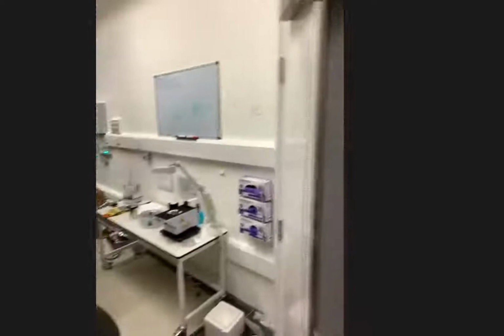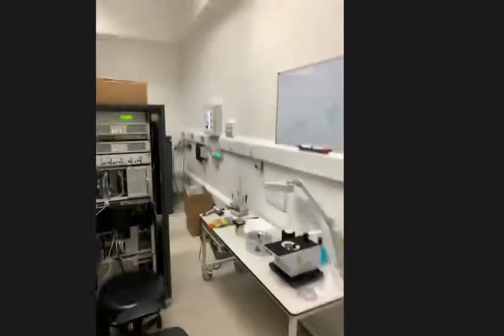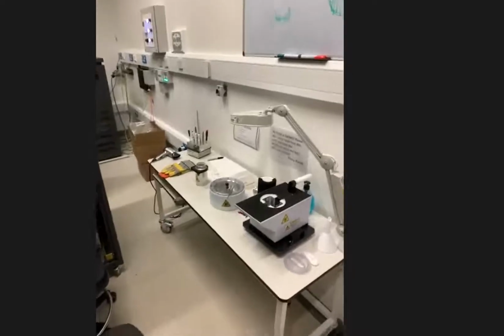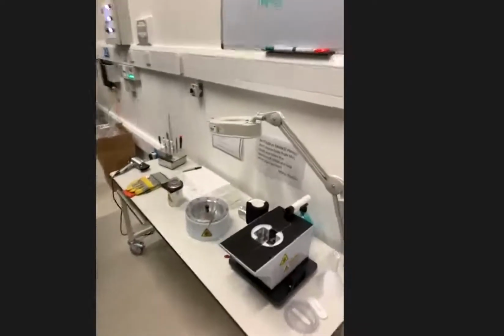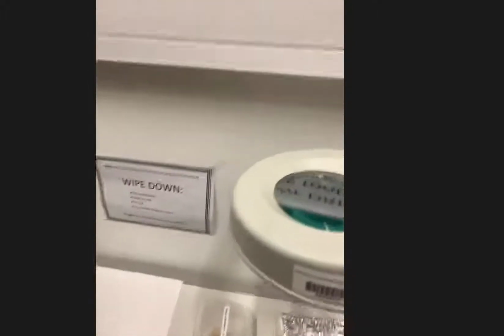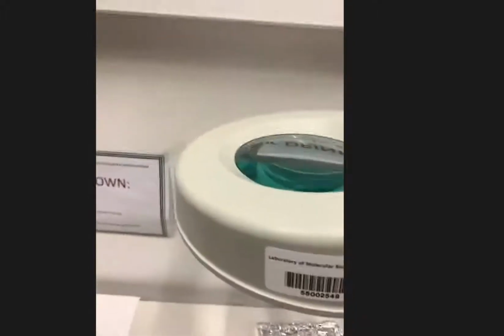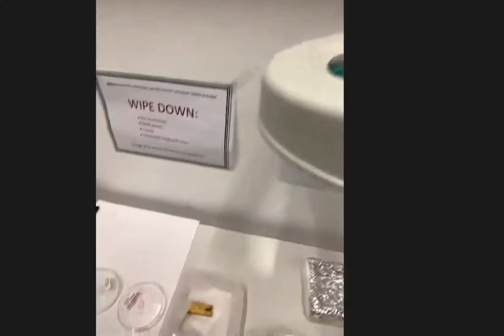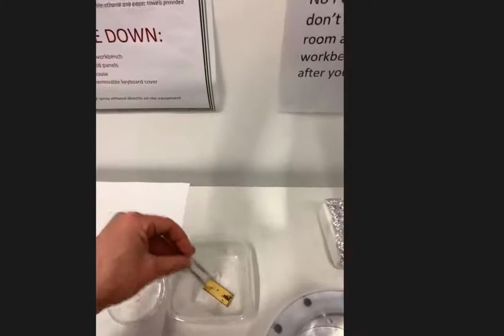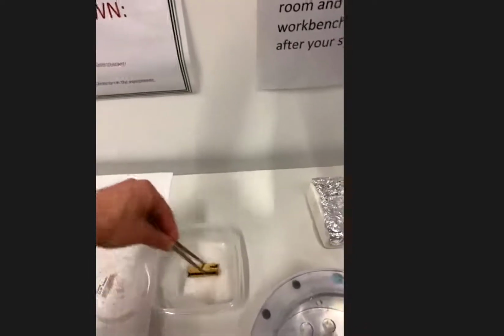The sample itself, I can try and show you. It's on one of those grids. Here. So this was the sample preparation. Everything, of course, is done under liquid nitrogen. And what you have is those grids, and they are then placed into a structure like this.